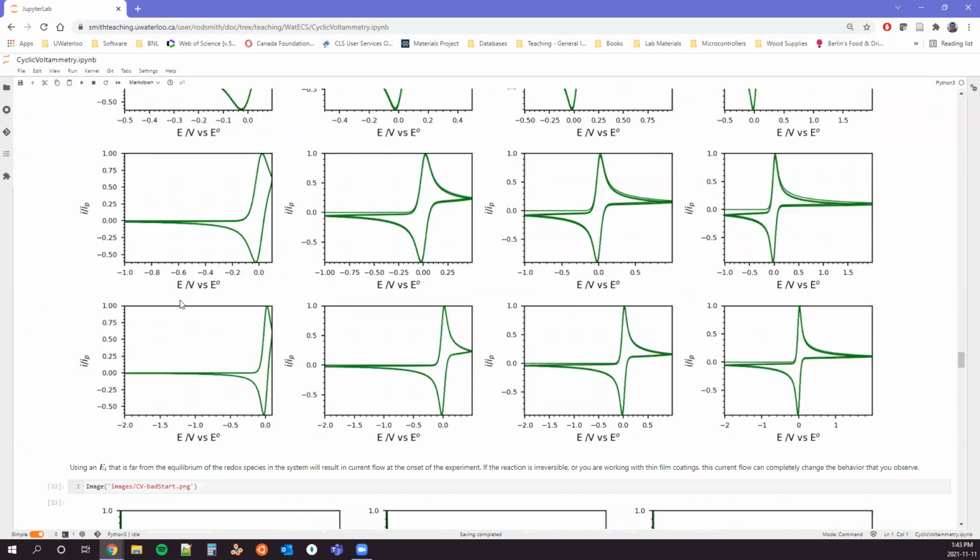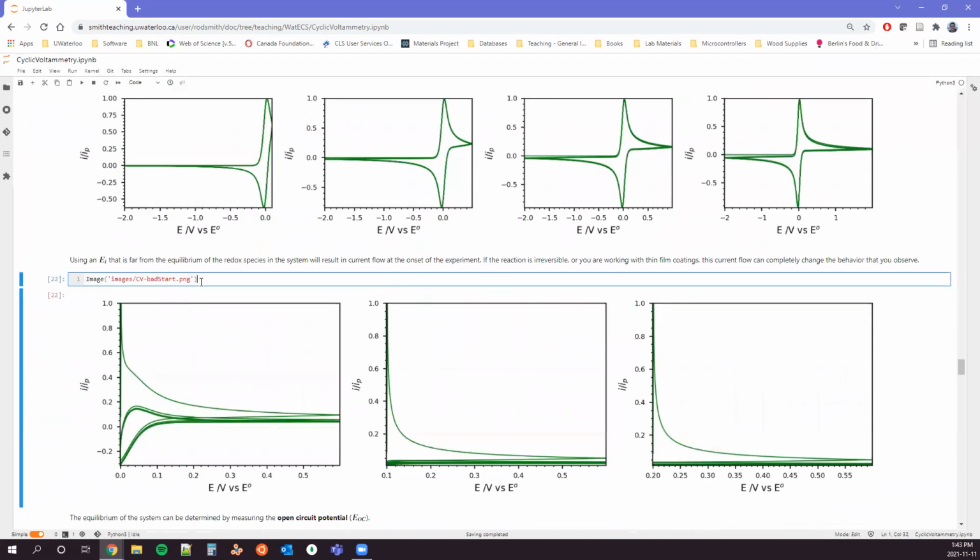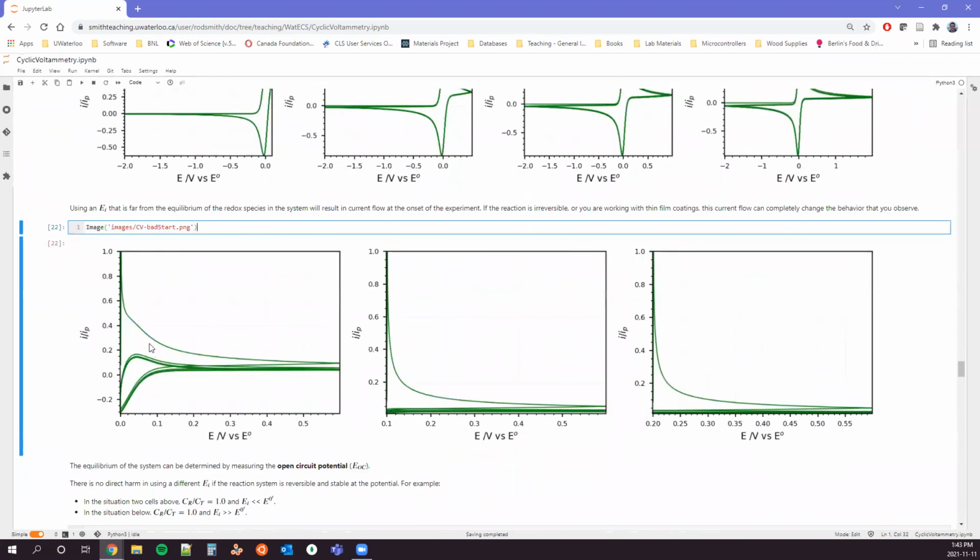We want to be careful. If you're studying a new system, you have to think about what is actually in there. If we do a bad start, for example, if we choose our initial voltage to be something that's far away from our equilibrium point in our solution or on our surface, here's what we would expect to see. Here we're in a fully reduced system. We're starting at the formal potential. We see this huge oxidizing current flow. And as we go forwards, it gets worse and worse, right?